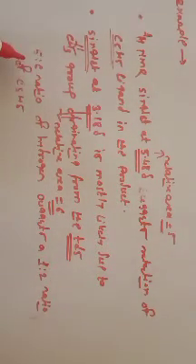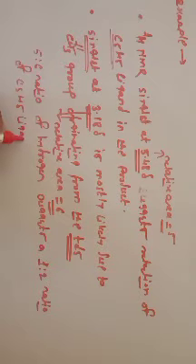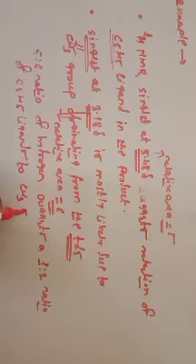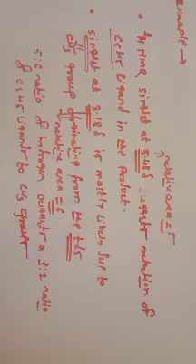So a 1:2 ratio means if 1 C5H5 ligand is present in the product, then 2 methyl groups are present, because the ratio is 5:6.